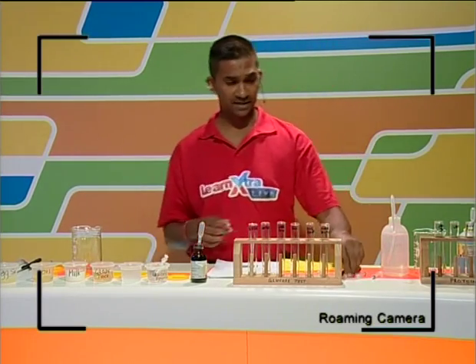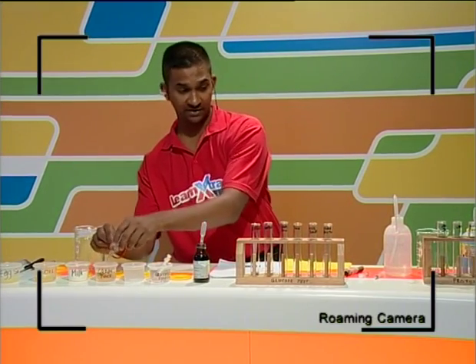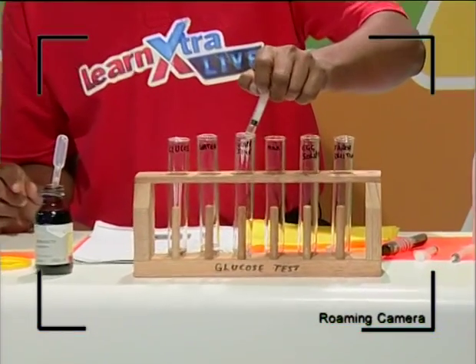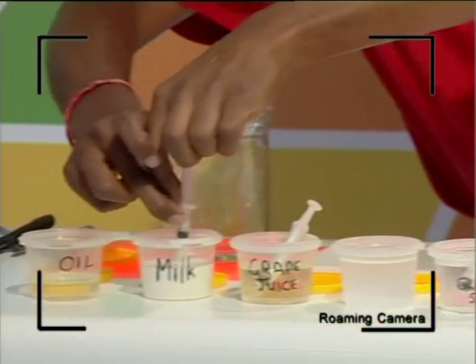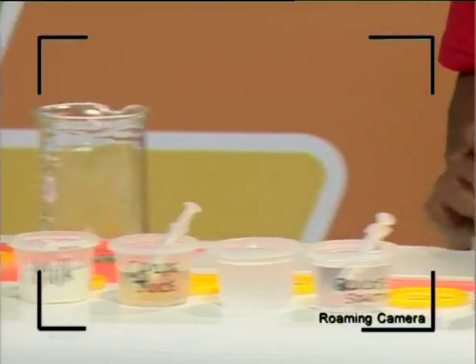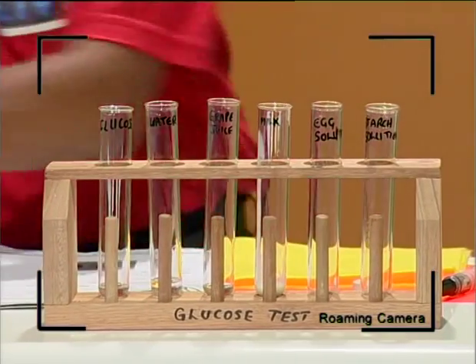The next tube is labeled grape juice, and so we're going to throw in some grape juice in there, and we know that grape juice is sweet, so we're expecting some results here, guys. So I'm going to put in about 2 mLs of grape juice into that test tube, and then we're going to add in some milk, guys. And we know what the value of the nutritional compounds in milk is, but we're not going to guess yet. Let's see if we get results that we anticipate. So that's milk that we've put in there.